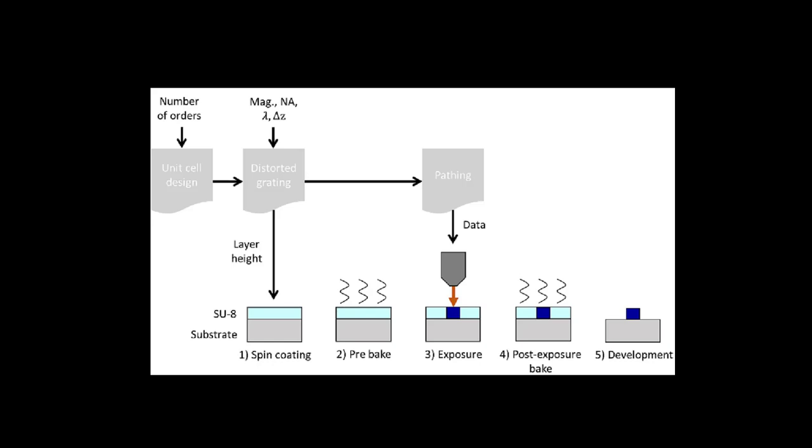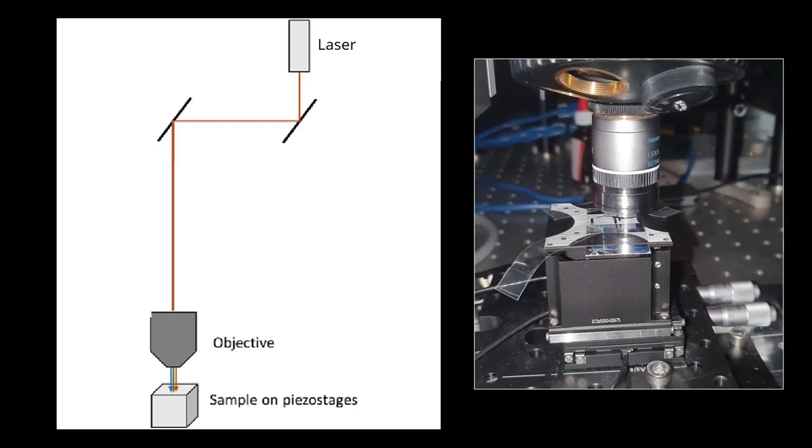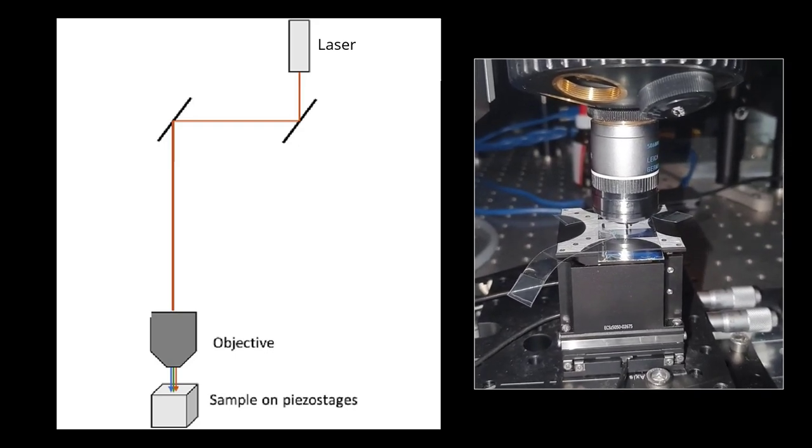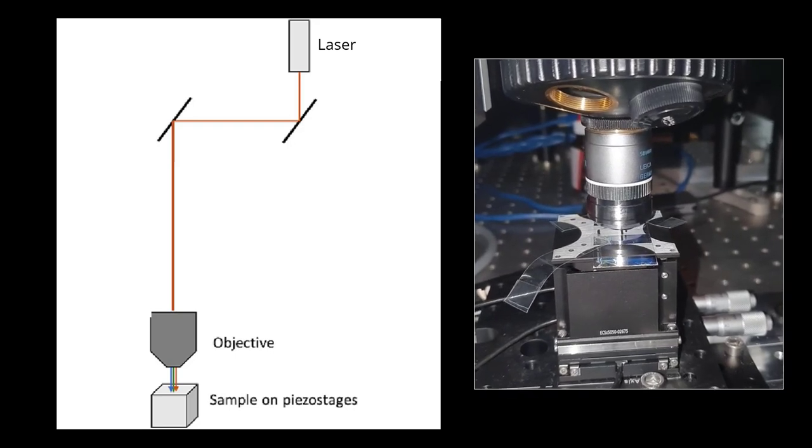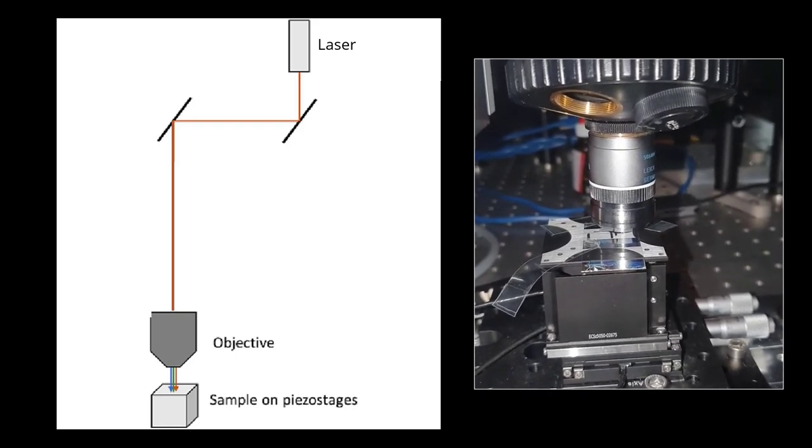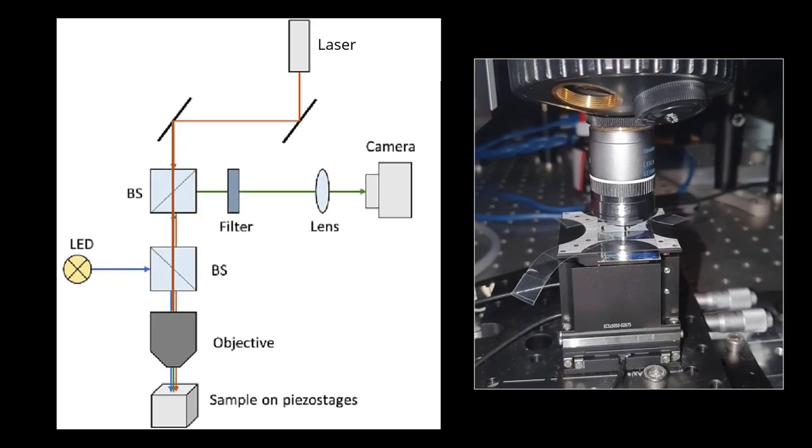In case you don't have a commercial lithography system, here's the one we built. Quite simple. A laser is focused onto the photoresist-covered glass plate, which is then moved by a piezo stage stack along the lines that define our grating. For checking how the sample is doing, we also added an LED and a camera.